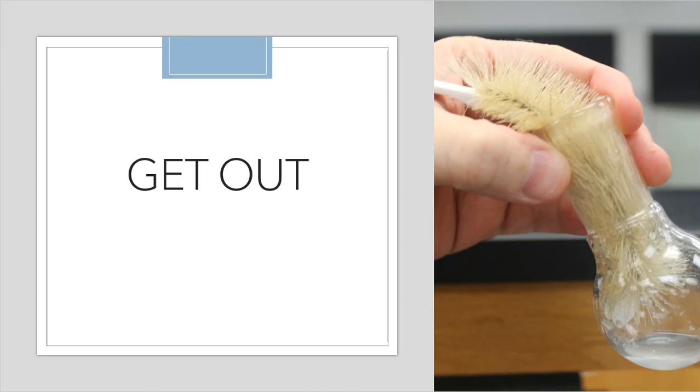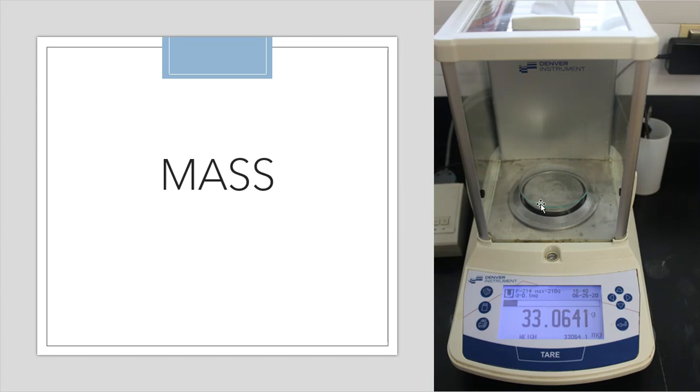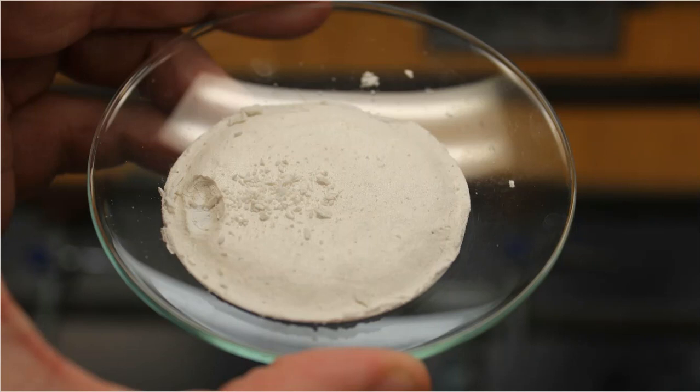Well, I'm going to have to dry this stuff, so what does that mean? Well, I look at my product, and I notice that there's quite a bit. So I go back to my balance, I tare it out, and then I add a watch glass. And that watch glass is just going to hold my filter paper and any loose crystal that might fall off of that filter paper. That's what the watch glass is for. So the watch glass weighs 33.0641 grams. So I take everything out of the Buchner funnel. I put it onto the watch glass. Notice that I do have some remnant that fell off during that transfer, which is fine.